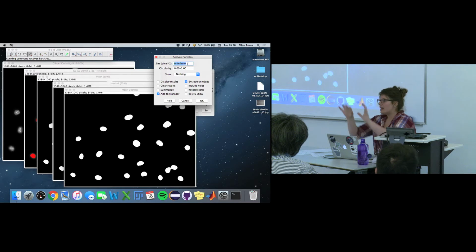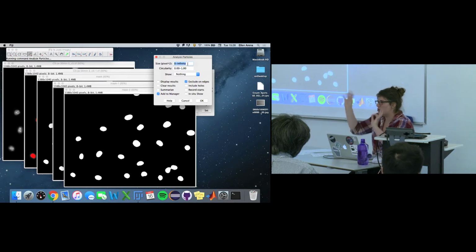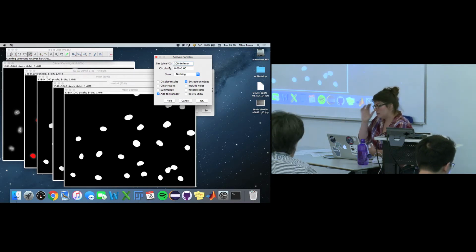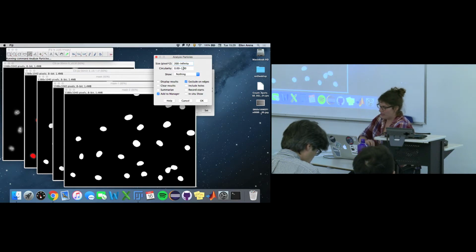But let's say you have little punctate background noise; in this image we don't have a lot of noise. You kind of want to filter that out, so you could set a minimal size threshold. In this case, we could set it to 200, for example. Then there's also circularity, which ranges from 0 to 1, 1 being a more circular object. Again, pre-filtering really depends on your biological question, so you don't want to introduce bias into your results, right?